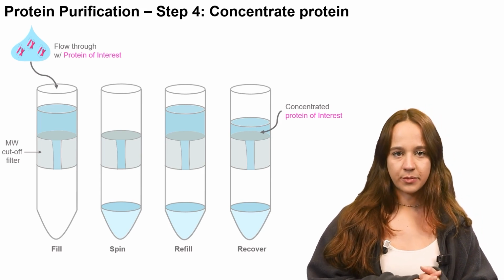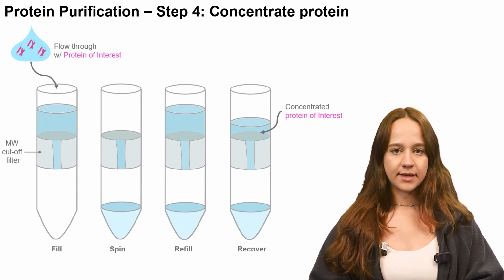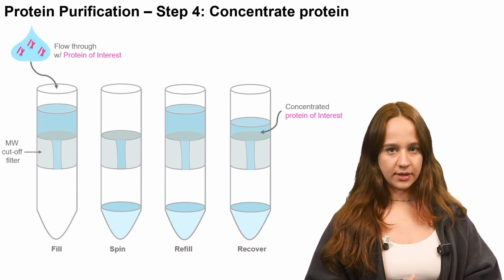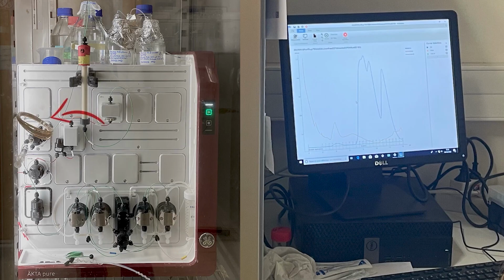The last step of purification is performed on an FPLC system that allows to monitor very precisely where the protein elutes by following the absorbance at 280 nanometers of the eluting sample, all throughout the purification. The sample is first injected into the loop mounted on the system with the help of a syringe and a needle.